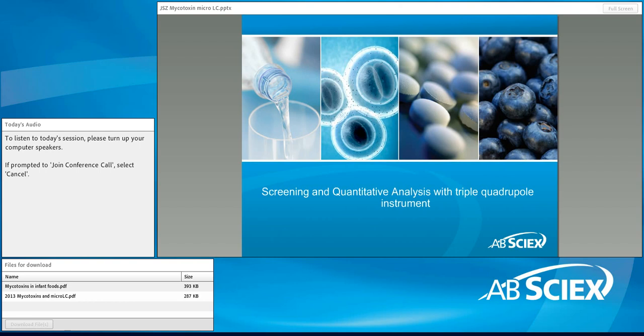Okay, so now I would like to present our results and the method we used here. And this method we use for both screening and also quantitation.